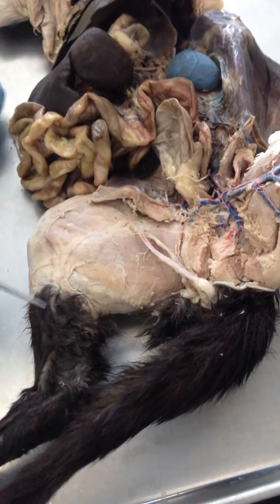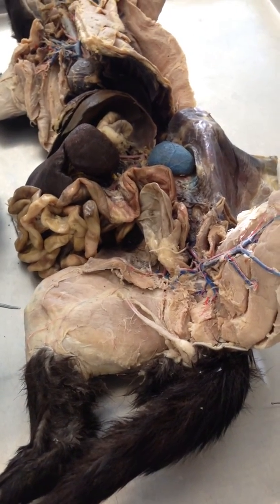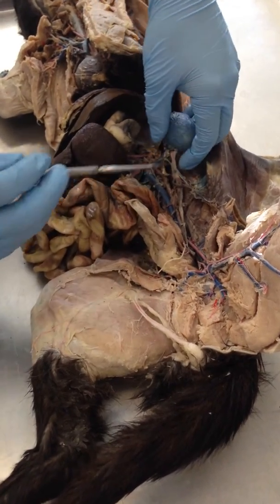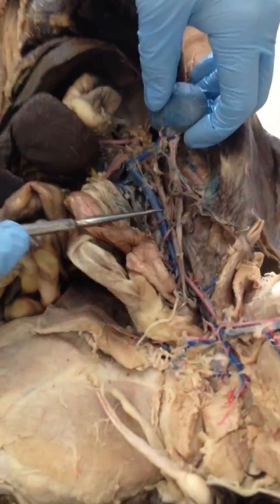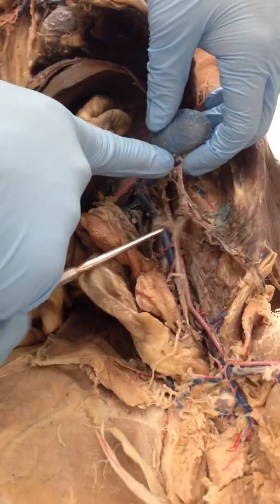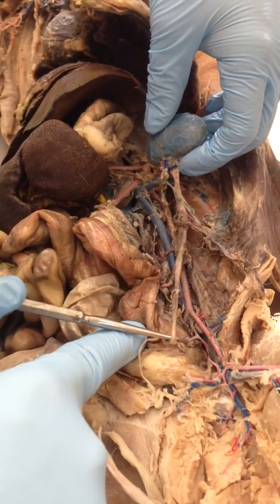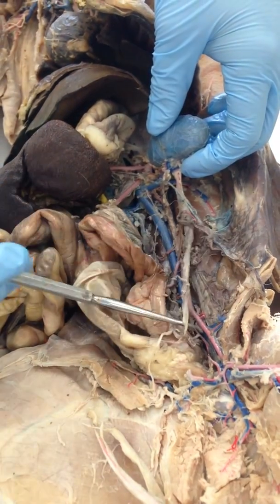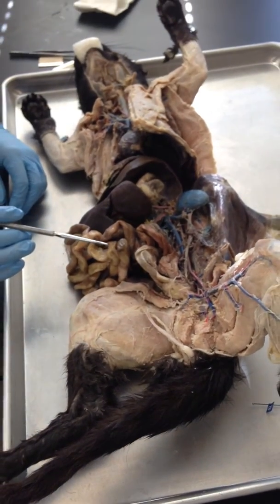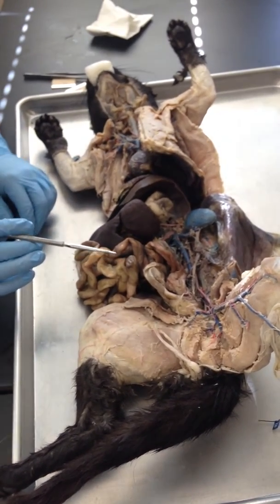Okay. Nina, do you have any questions? The only other thing would probably be the ureter, and make sure that we get the right one. Is that this thing right here? That's the ureter, because you can trace it all the way from here. All the way down, it attaches to the bladder. So the ureter, you may have a little bit of other junk with it, but the ureter's in there, and it's fairly big. It's fairly wide. It's just a tube.